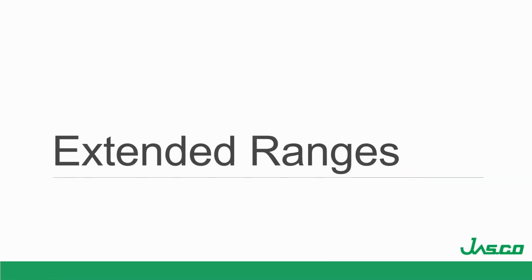All right, so I've been talking about mid-IR. I want to talk a little bit about far IR and near IR as well.